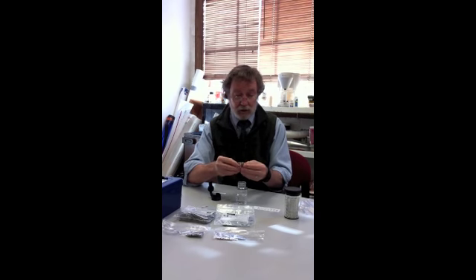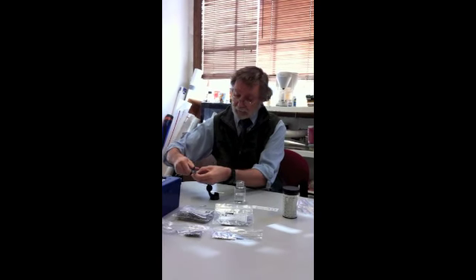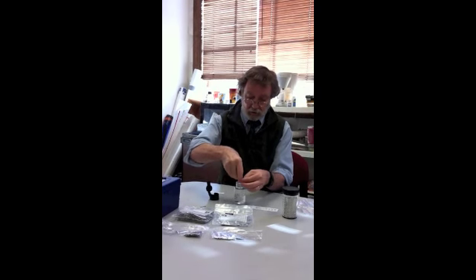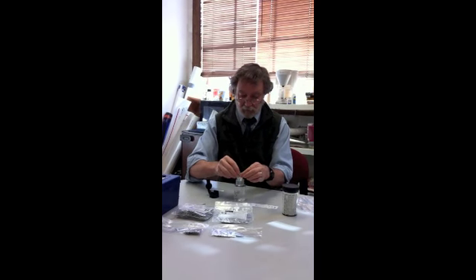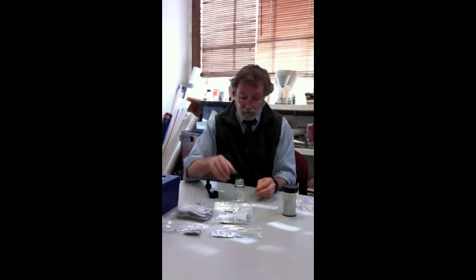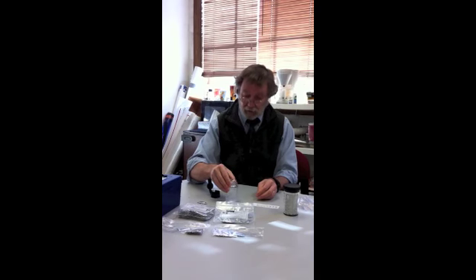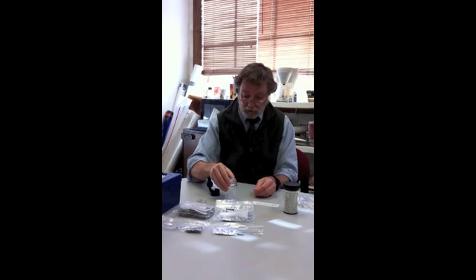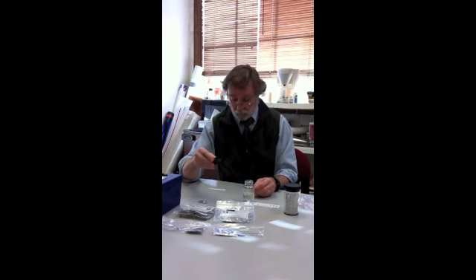And then add the contents of this sachet to the vessel by tipping it in and just ensuring that all of the material has gone in. Now it doesn't dissolve immediately, so you want to swirl the solution, and this may take a few minutes to do this.